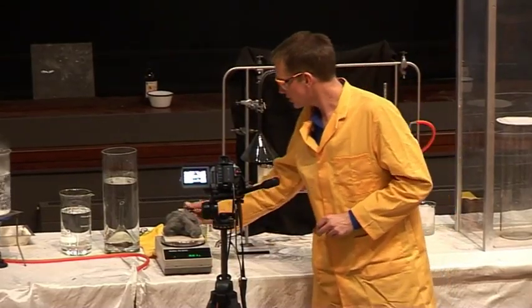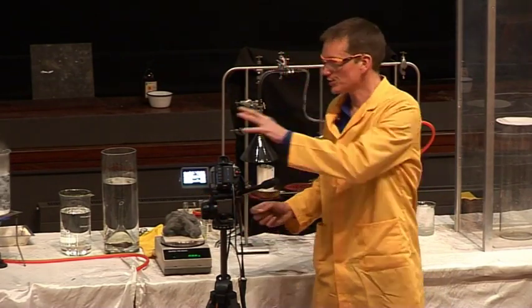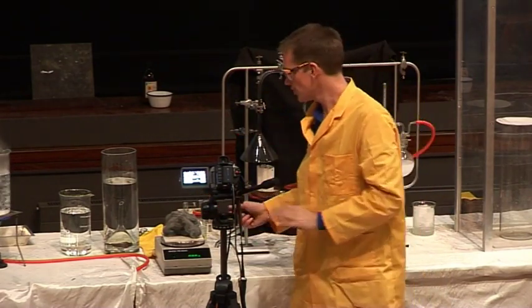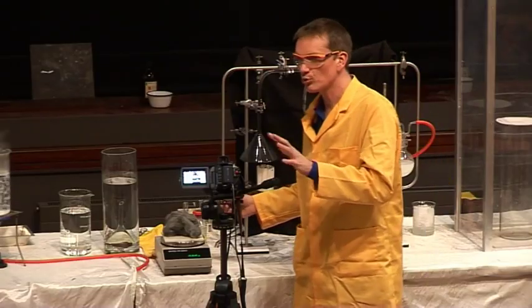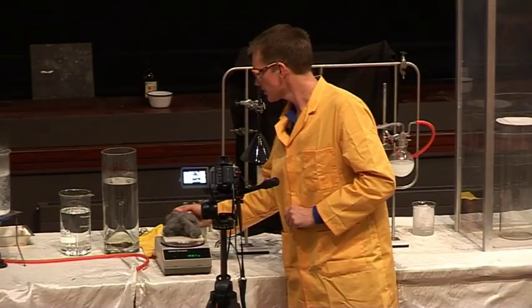So if I just start this, get this to burn. Now, it's not quite as vigorous as with the oxygen that I added before. That was concentrated oxygen. This is just going to burn in the oxygen from the air. It's much more slow and controlled combustion. We have the lights down, please. There we are. It's just going now. So let's start it around here as well.